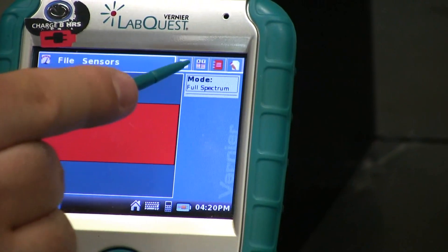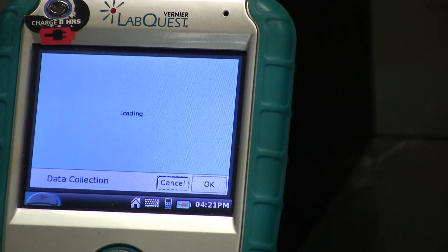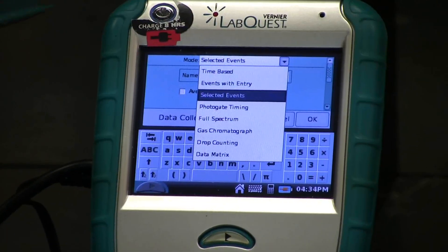While in the meter screen, click on Mode. You will then need to change the drop-down menu to Events with Entry.